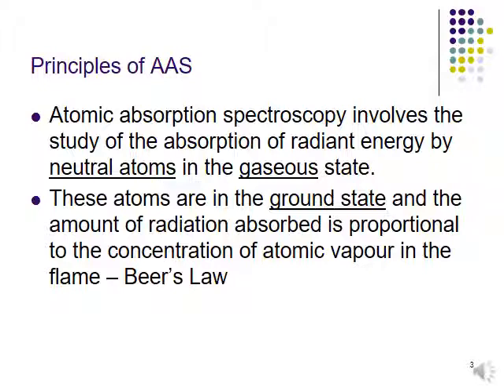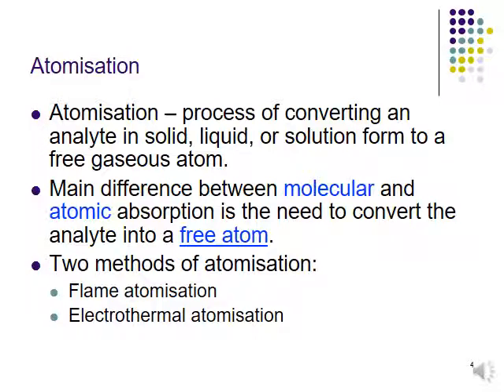And basically when we talk about spectroscopy, we are talking about Beer's law. I hope that most of you already learned about Beer's law in analytical chemistry. When we talk about AAS, we are focusing on the source of energy.